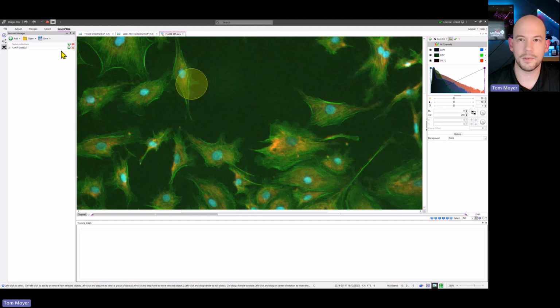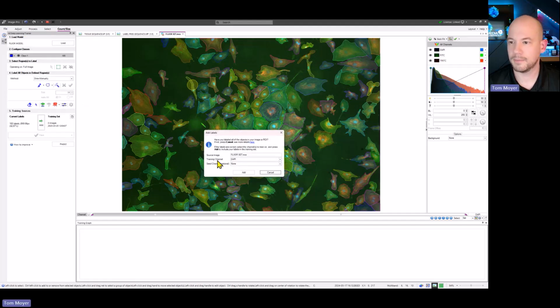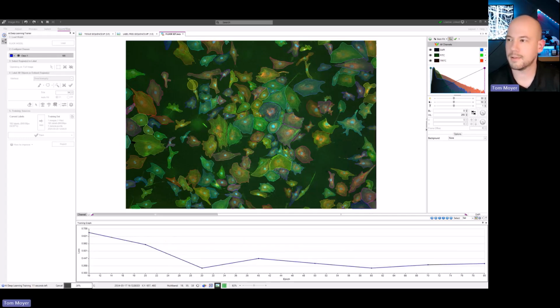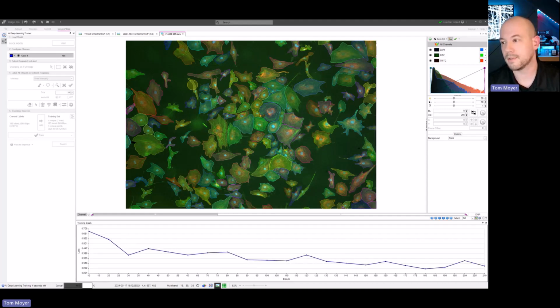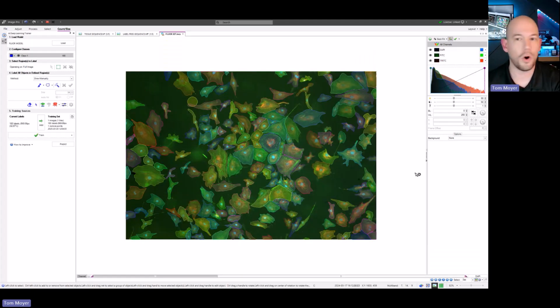So I've saved these labels as well. We'll apply this to the image, add it to our training set. So training channel is going to be FITC, seed channel is going to be DAPI. I add these into my training set, click on train, and I can apply the newly trained model to my images. So it's a pretty straightforward process. Most of the time, this happens very quickly and usually only requires one or two regions within an image for the model to accurately identify what we're looking for it to identify in all of the images.